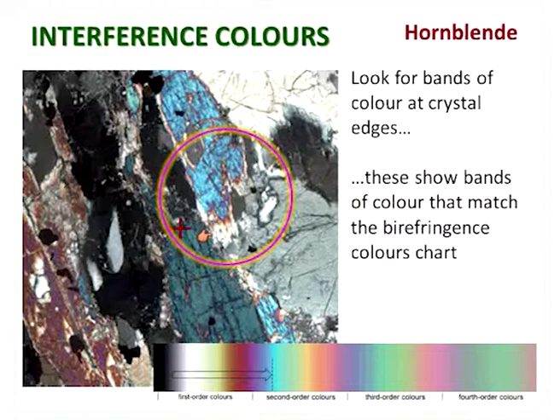So these beveled edges, these wedge-shaped edges of crystals, are not that common in thin sections, but wherever you see them, they're extremely useful. And again, it is a question of picking out the crystal shapes. It helps, of course, and at this point it'd be lovely to be able to flick back to the plane polarized light view and say, okay, yes, we can see that this blue crystal here is one definite crystal, and it is separate from the others.